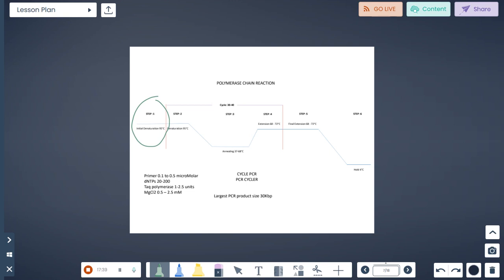Usually a PCR buffer at room temperature will be alkaline, so it will help in the denaturation very easily at 95 degrees centigrade. You also know that the pH is dependent on the temperature. So when the PCR buffer cools down to the extension temperature, it will be at an ideal pH for the enzyme to perform. So you don't have to worry about it.